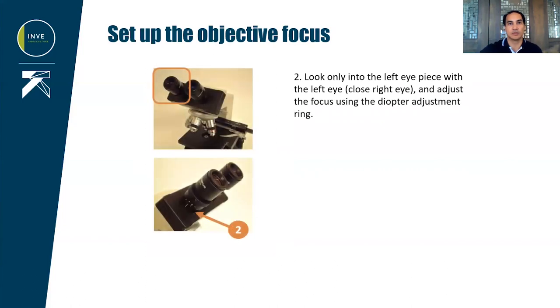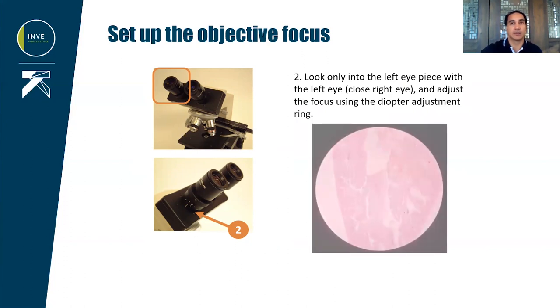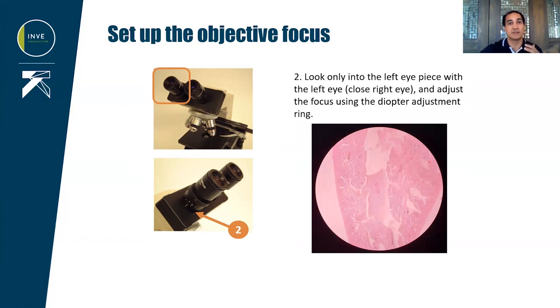After that, cover your right eye and with the left eye, look into the left eyepiece. Adjust the focus using, this time, the diopter ring, which is at the base of the left eyepiece. Again, the image should be sharp.